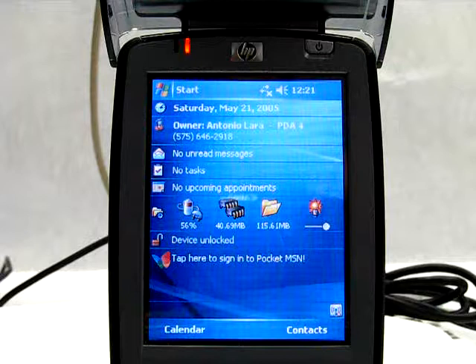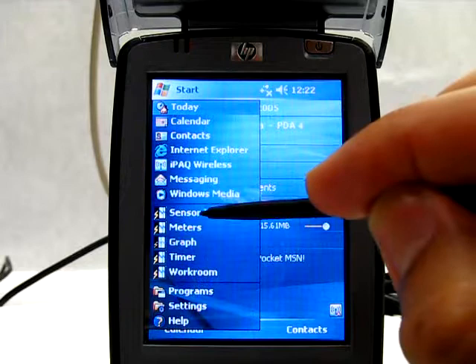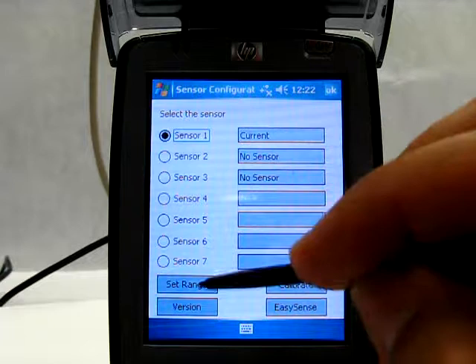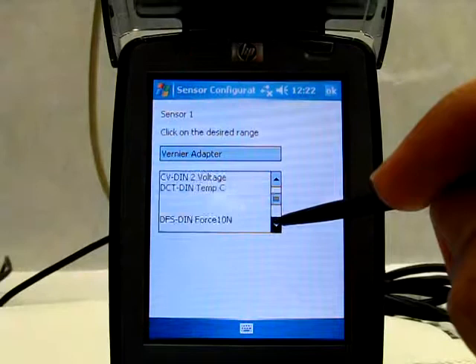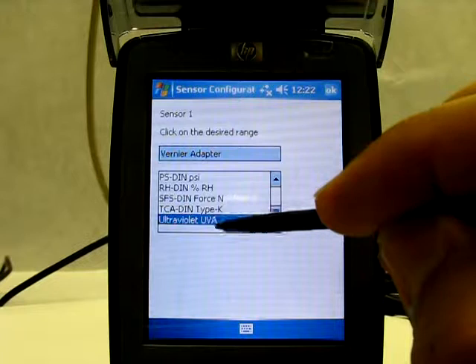Now, let's take a look at the experimental setup. The first thing we have to do is configure the PDA to receive the measurements from the sensor. Turn on your PDA and press start and then sensor configuration. Look and if in the box next to sensor 1 it doesn't say Vernier Adapter, press set range and find Vernier Adapter at the end of the list. Click on it and you are ready to go. Press OK and OK again.